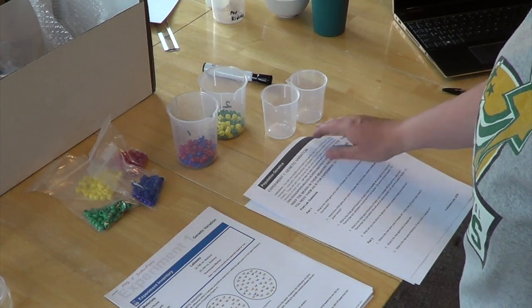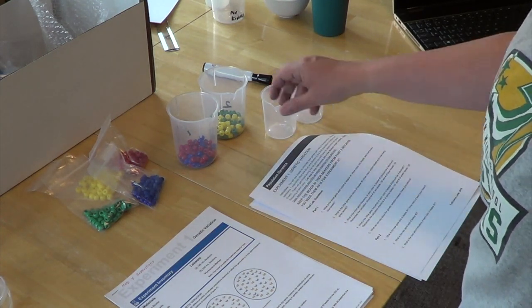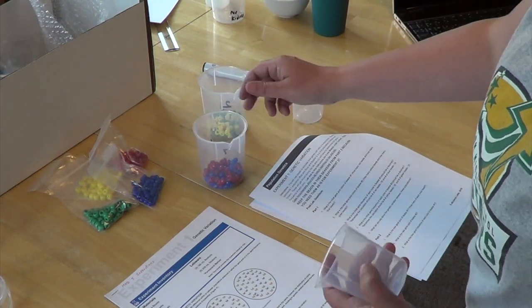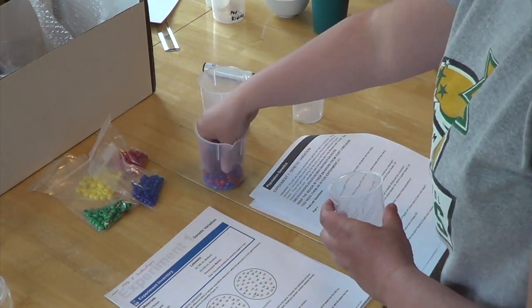And then what they want you to do is, without looking, similar to what you did in Module 3, pick 50 beads out, put them in another beaker, and we're going to have this be beaker 1. So I'm just going to start selecting.